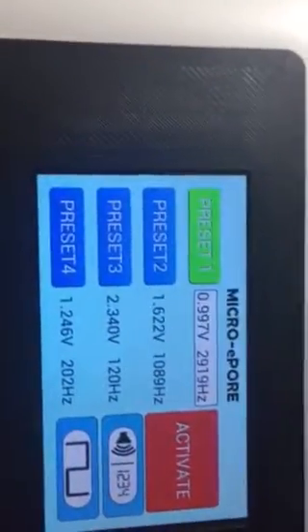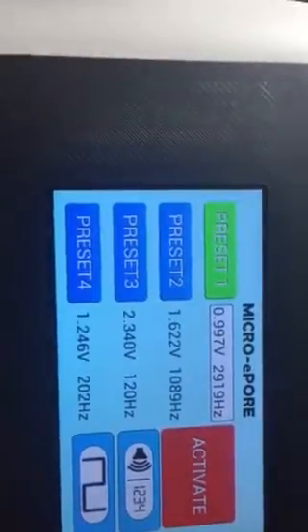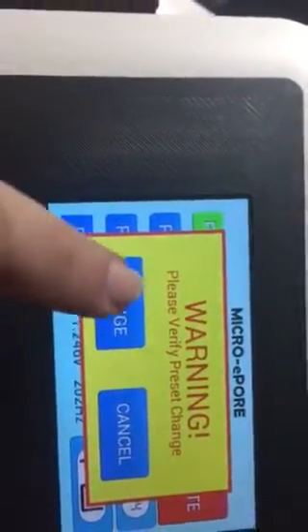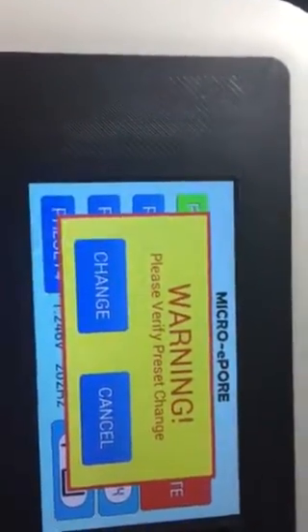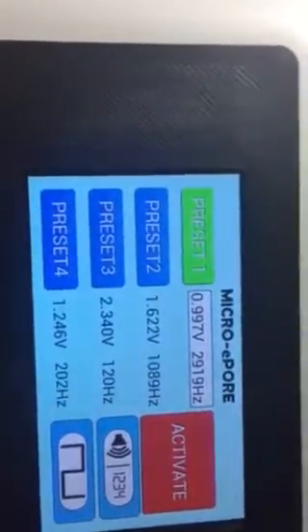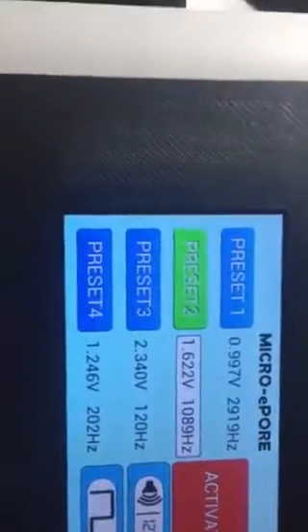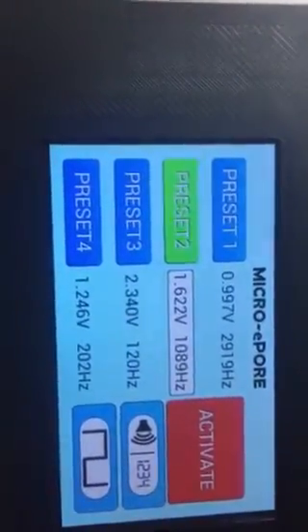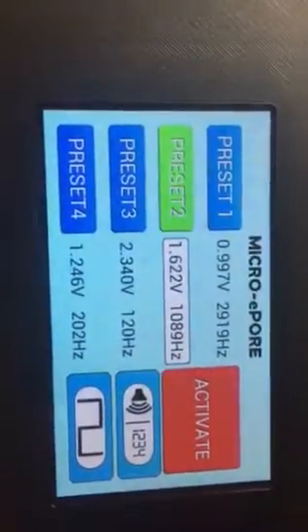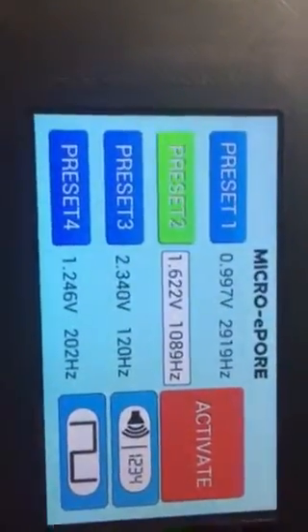We have added a confirmation message. If you try to press the same setup, nothing happens. But when you try to change setups, there will be a message asking you for confirmation. If you cancel, then nothing happens. If you go ahead and confirm, then now you're at a different preset. That's to keep someone from accidentally changing the preset without knowing and doing experiments with the wrong settings.